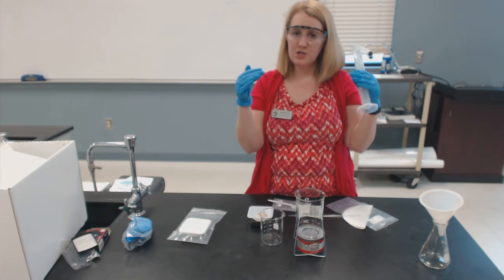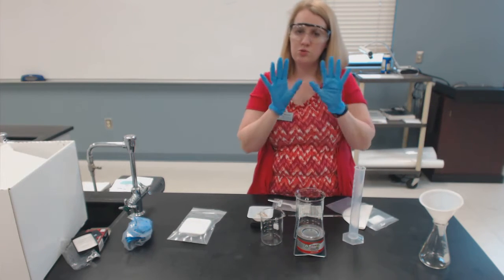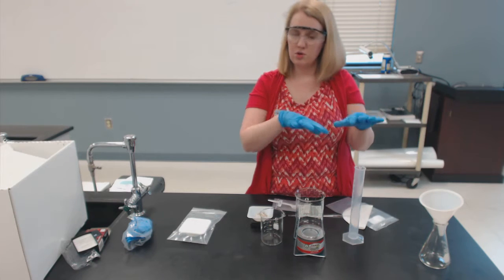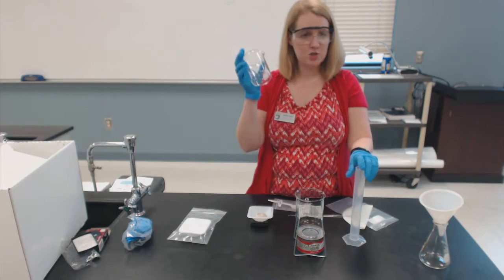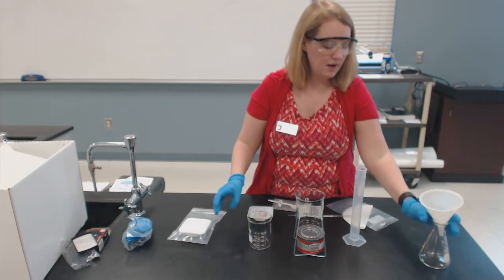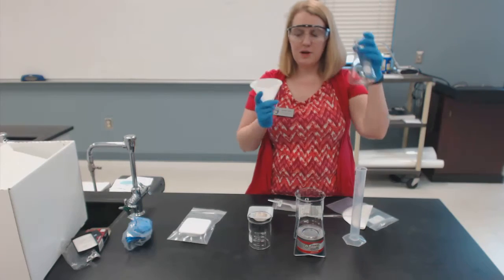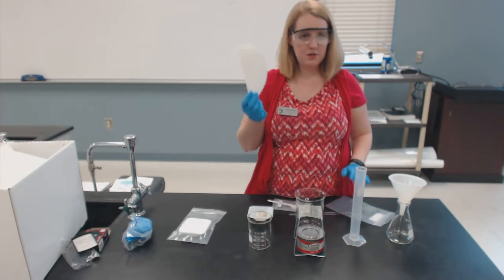In your procedure, precede it by a materials list that includes all the materials that you used. And make sure that you label how many milliliter graduated cylinder. Make sure you say a glass beaker, what size beaker. We have an Erlenmeyer flask and a funnel. Filter paper might be useful.